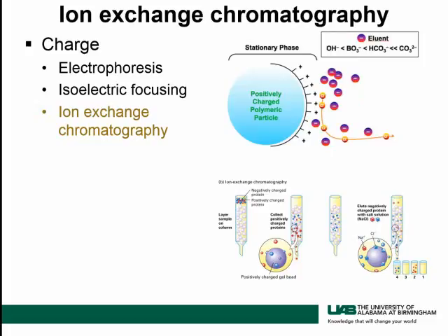Now, how do you elute those proteins? Well, the way you elute it is you just begin to change the pH of the wash buffer. You change the pH of the wash buffer so that it gets to the point where it's going to convert your protein from negatively charged to zero charge.